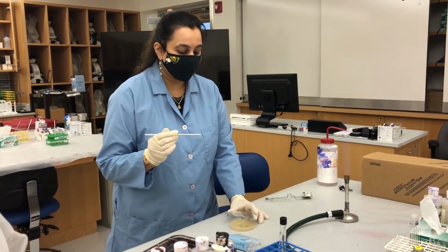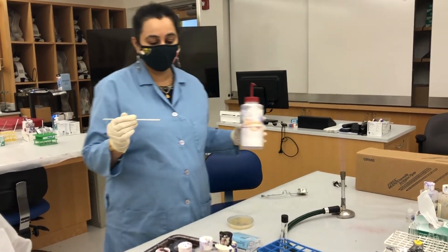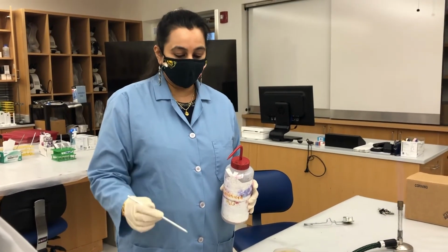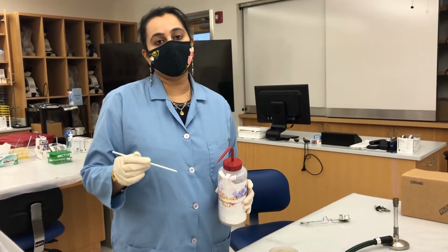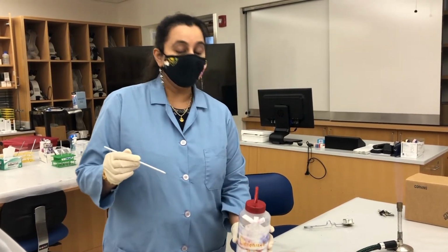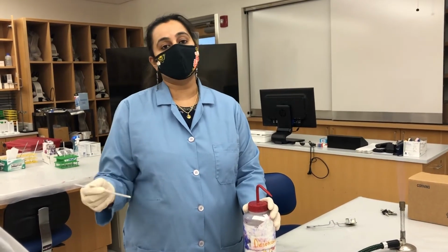Pick few cells, very few cells. You don't want to have too many cells, because having too many cells would make your microscopic slide too crowded and you won't get good gram staining pictures. Remember, the goal is to be able to identify or differentiate between the gram positive versus gram negative bacterial cells on the slide.